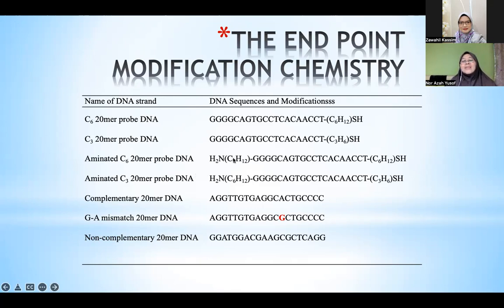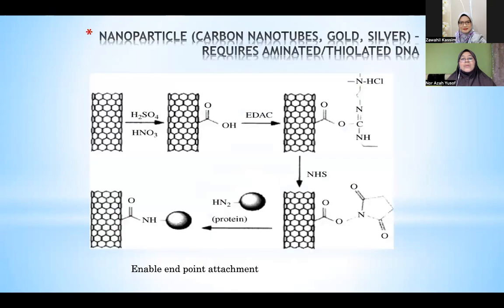It's actually a series of nucleic acids, the ATCG. So this one represents the gene of that specific virus or bacteria or microbes, fungus, for example. So when we talk about DNA, we know that if we test the DNA, then it's specific to that one specific target. Okay. So this is also another strategy.